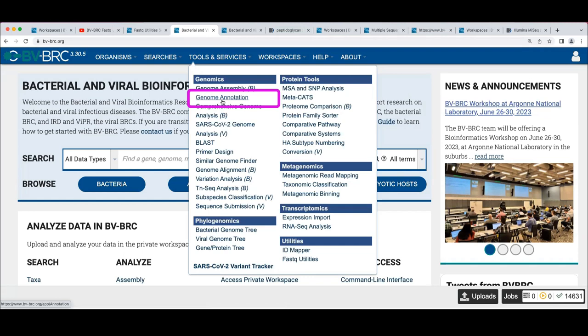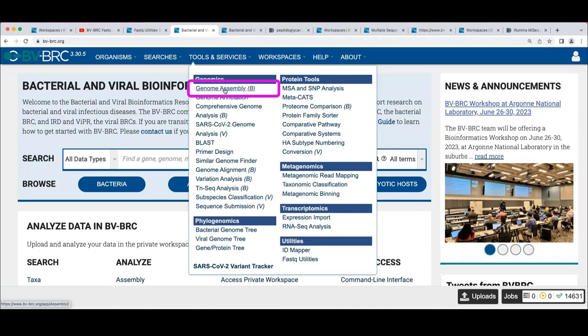The genome annotation service forks into two different flavors: one is the original bacterial RAST pipeline, and the other is Vigor4, which works for many different viral species. Vigor4 does a BLAST-based lookup of viral proteins because viruses within the families it supports are pretty similar, so it's more BLAST-based.